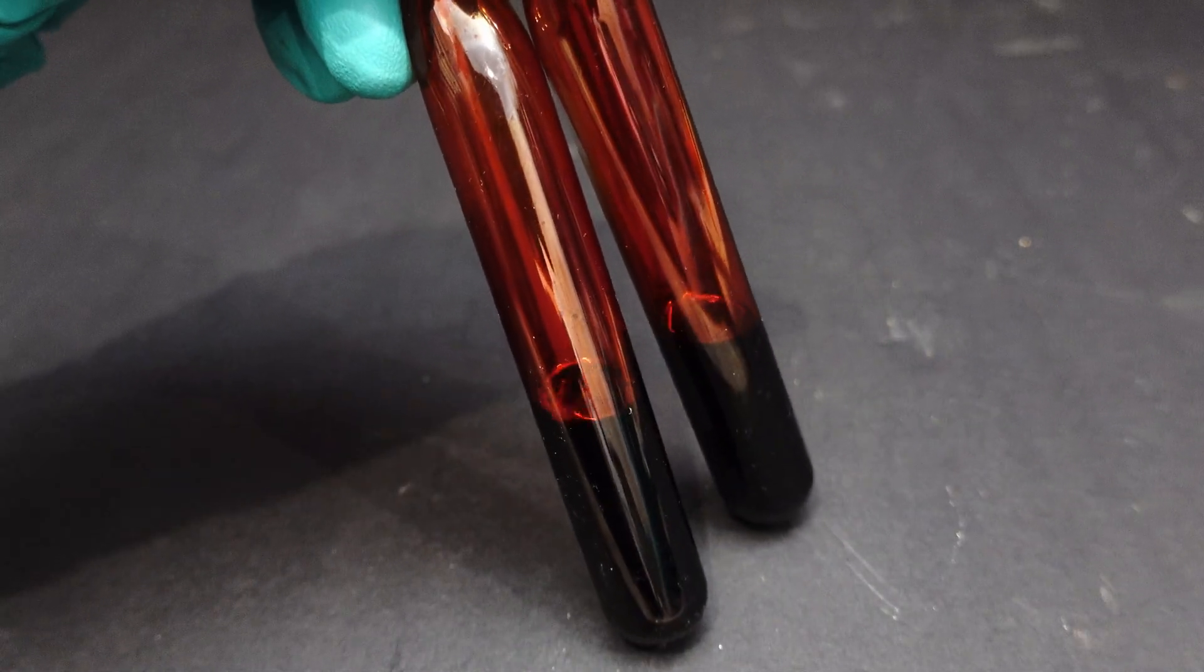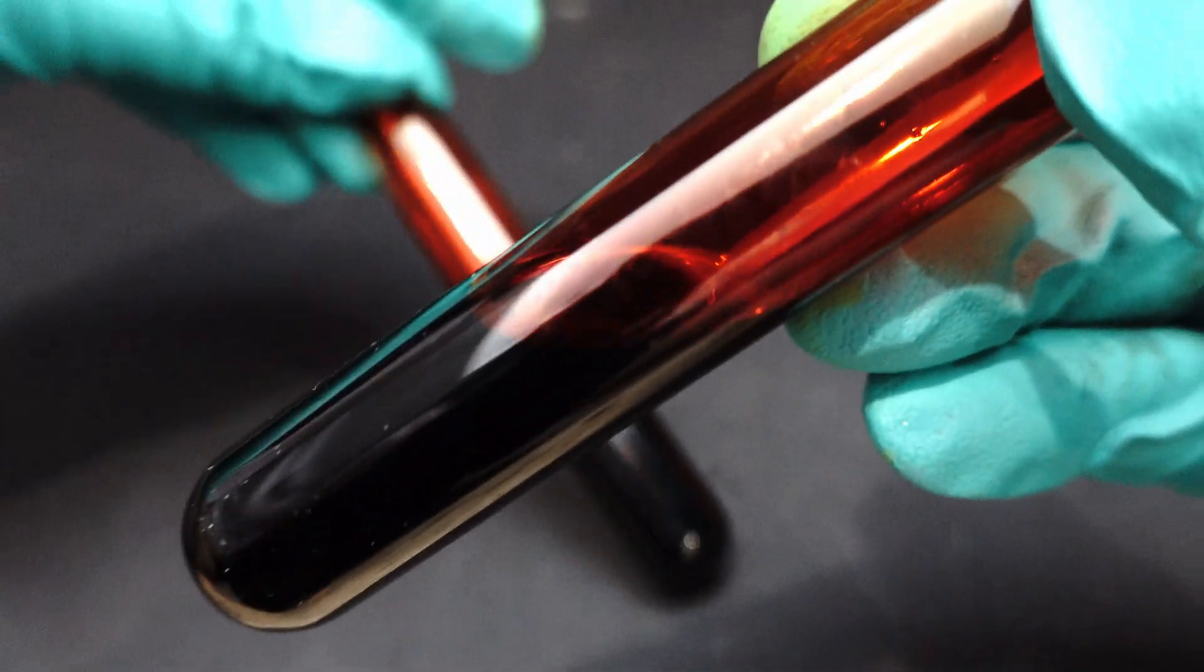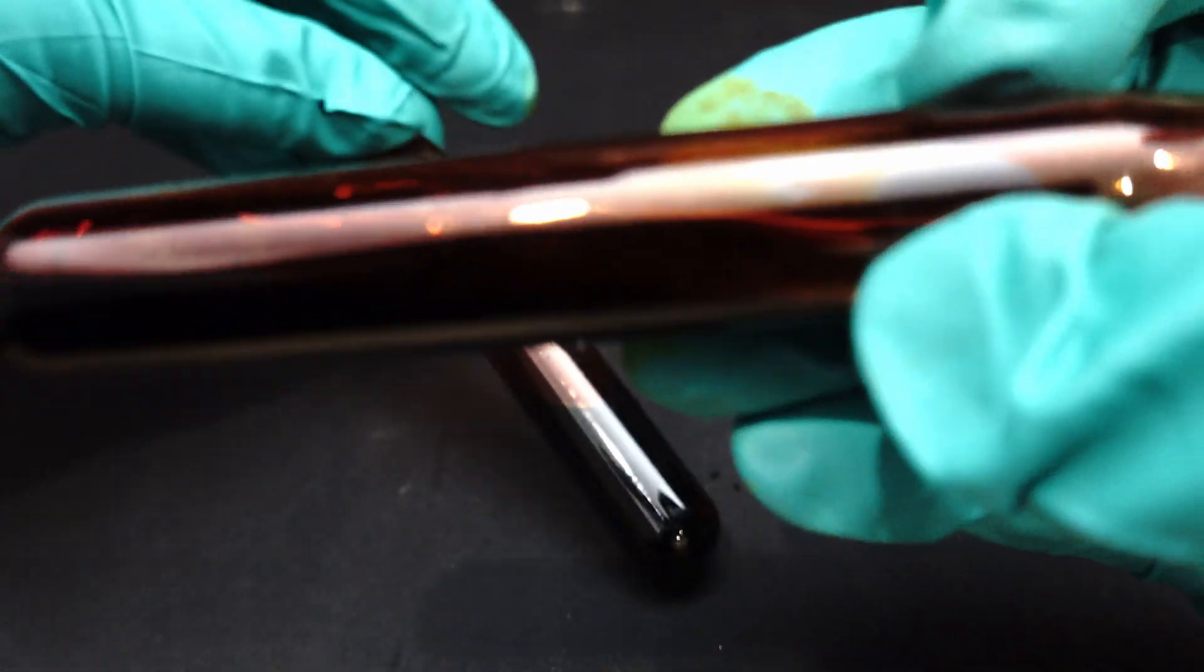I made two ampoules from glass tubes to store the Bromine and here it is, our final Bromine product. It is a very dark brown reddish colour, almost similar to soy sauce.